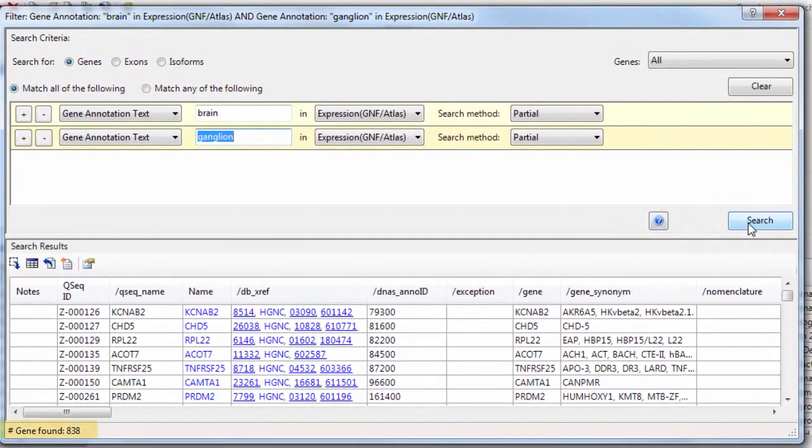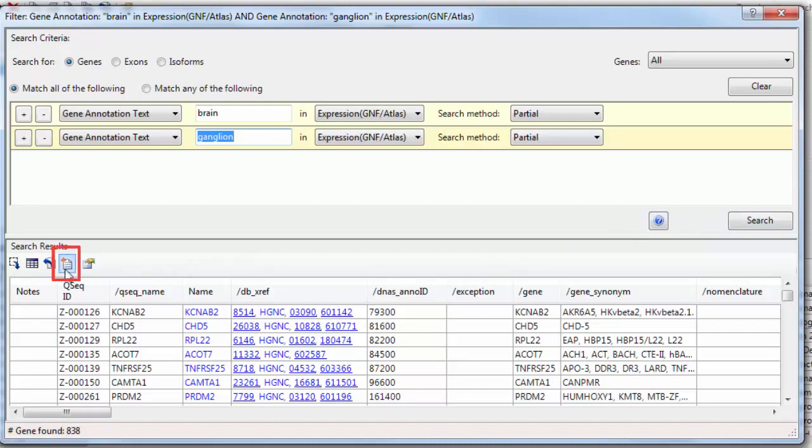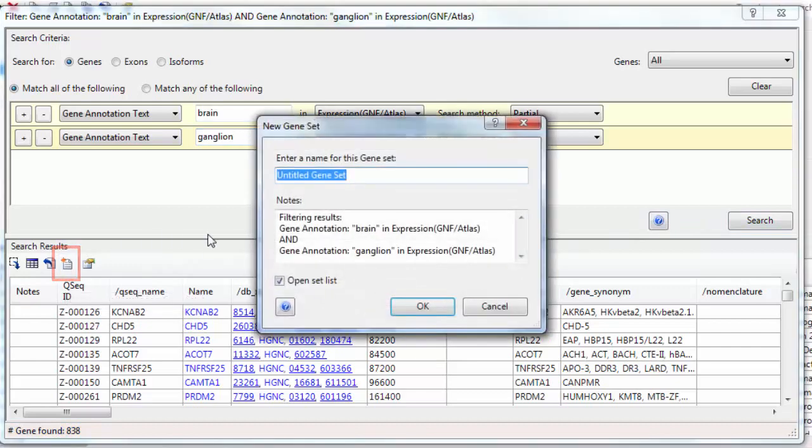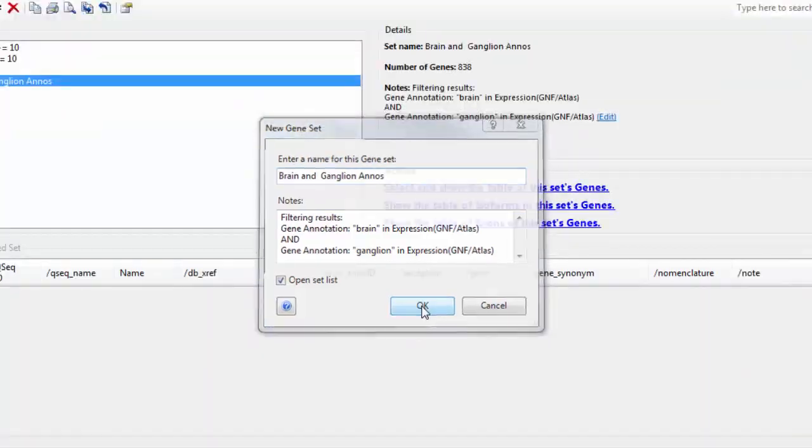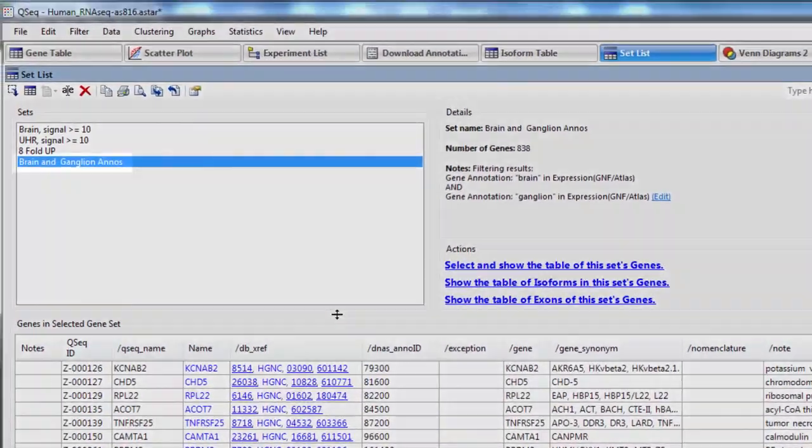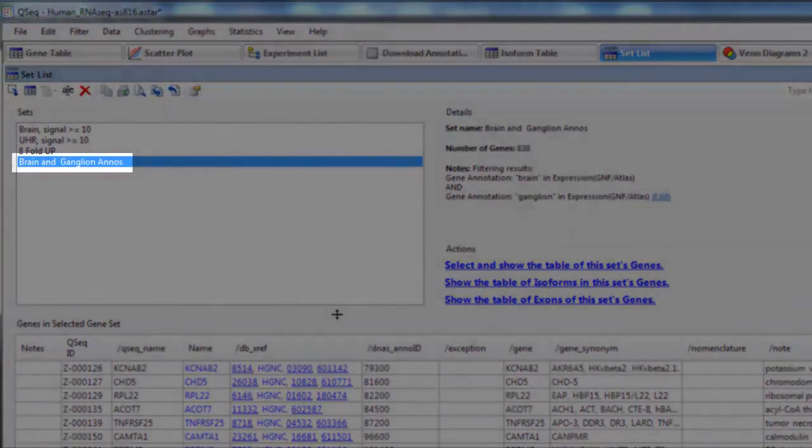You'll see it found 838 genes, so I'm going to save those as a gene set by clicking on this button here. Click OK, and there's my new set.